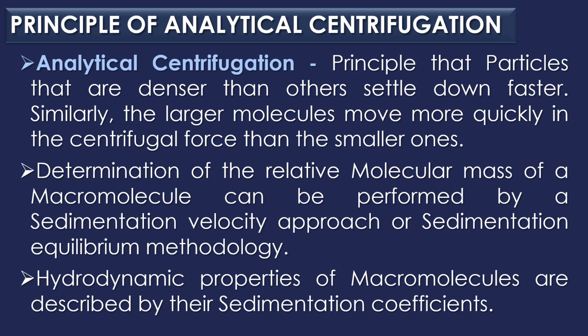Principle of analytical centrifugation. Analytical centrifugation is based on the principle that particles that are denser than others settle down faster. Similarly, the large molecules move more quickly in the centrifugal force than the smaller ones.